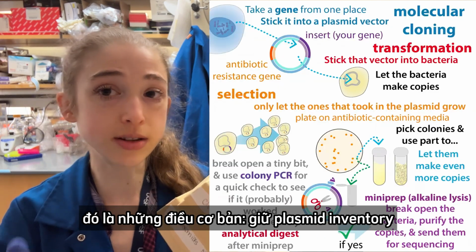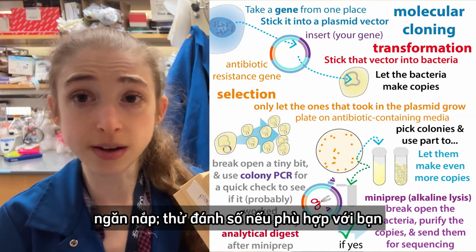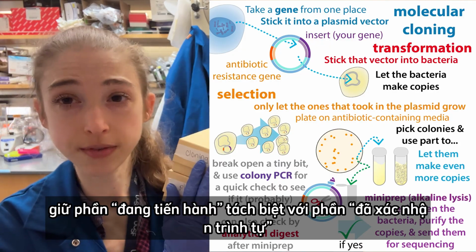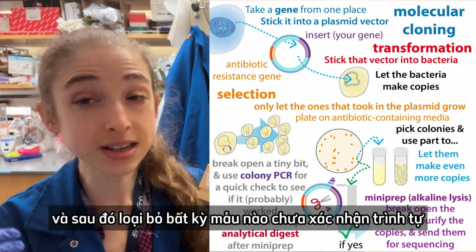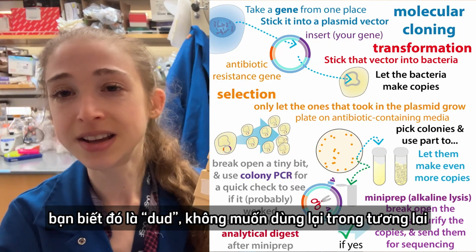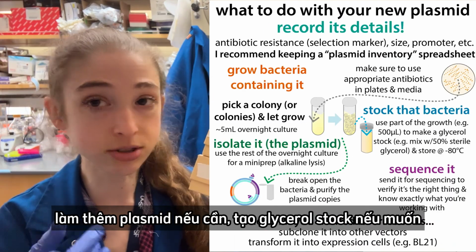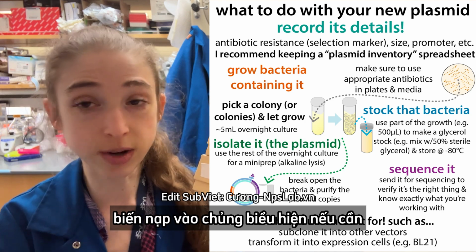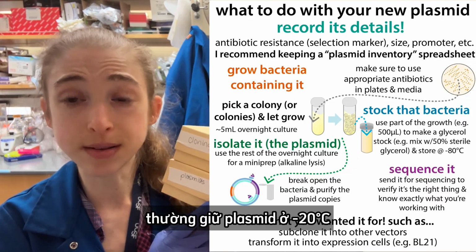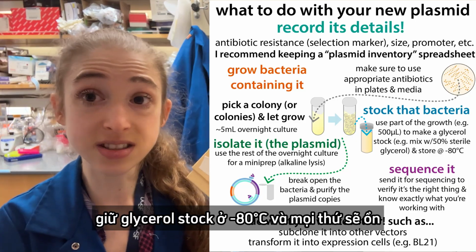So yeah, that's the basics. Keep your plasmid inventory, keep your constructs nicely organized. Try numbering if that works for you. Keep your in progress separated from your sequence verified. Make sure you do sequence verification, and then you toss anything that is sequence unverified or sequence bad that you know is a dud. You don't want to use that in the future. Make more plasmid if you want. Make glycerol stocks if you want. Transform into expression cells if you want. And make sure that you typically keep the plasmids in the -20, keep your glycerol stocks in the -80, and all should be good.